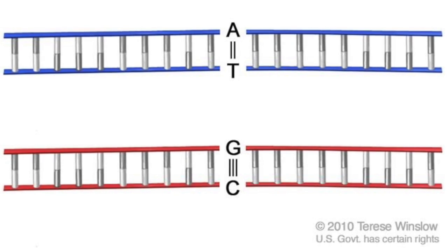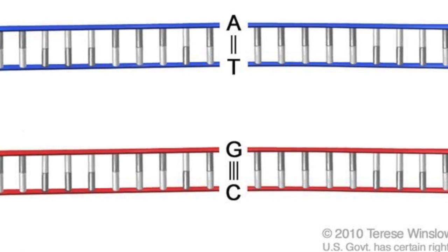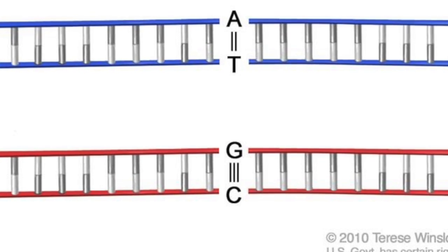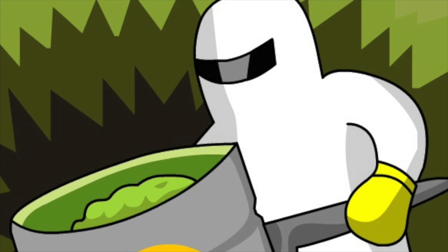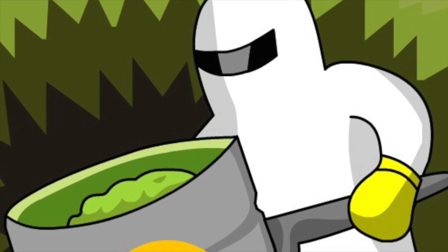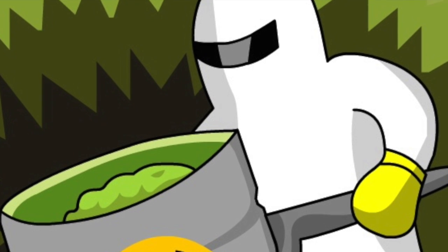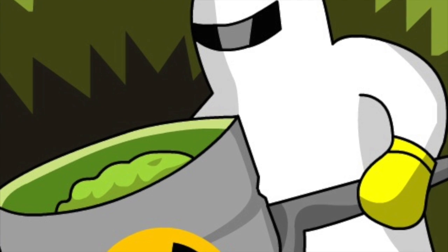The reason why the Maxam and Gilbert method lost popularity was because it was time consuming. Using this method, you could only confirm about 200 to 300 bases of DNA every few days. It also required working with large amounts of radioactive material and working closely with hydrazine, which is a known neurotoxin.